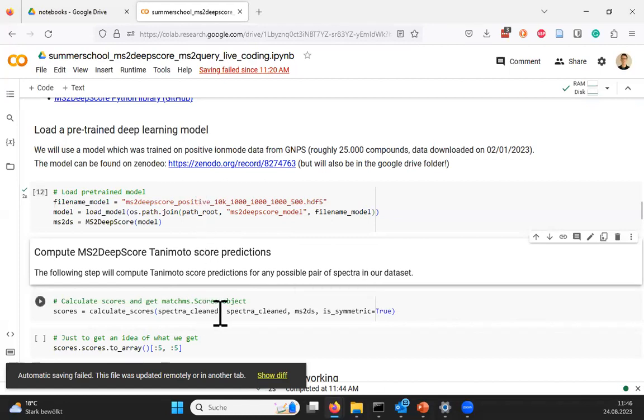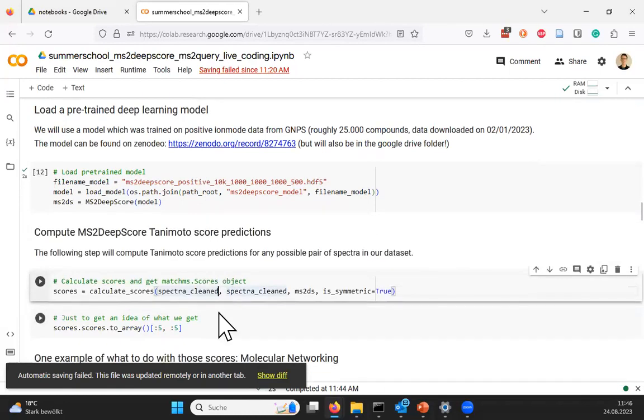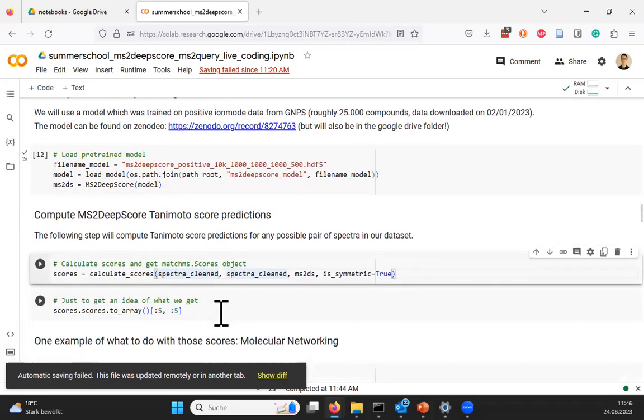Let's say you have this imported, then you can do something, and that is a bit slower operation. You could use scores. I'm skipping this step on purpose now because that is the slow part. We can do this live, but in view of time, I'd like to jump ahead a bit to a second use case.